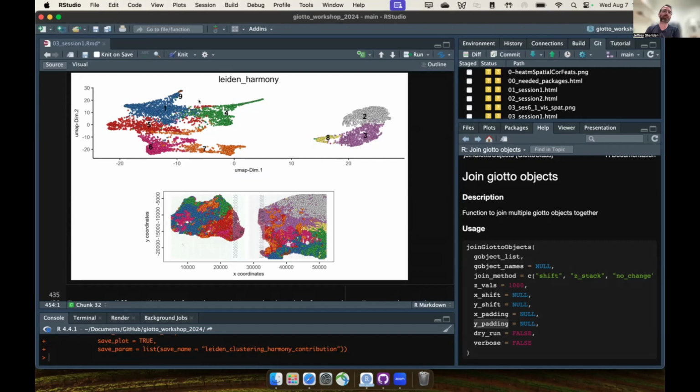So what we're able to actually do is cluster together the like cells, the normal healthy non-cancer prostate cells, but retain the cancer cells as their own unique clustering. So we're not performing over-clustering by integrating the cancer cells with normal healthy prostate samples, meaning that we're able to retain biological information whilst grouping things that are similar.